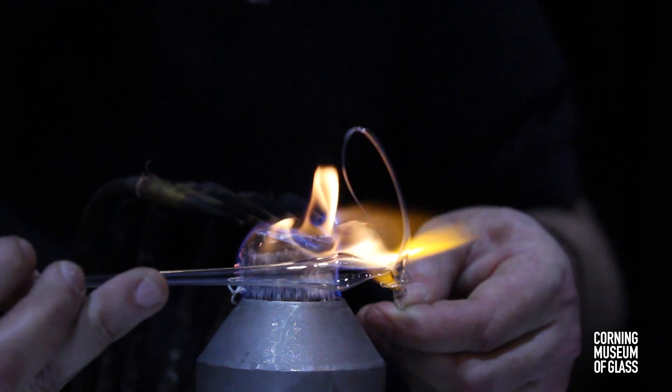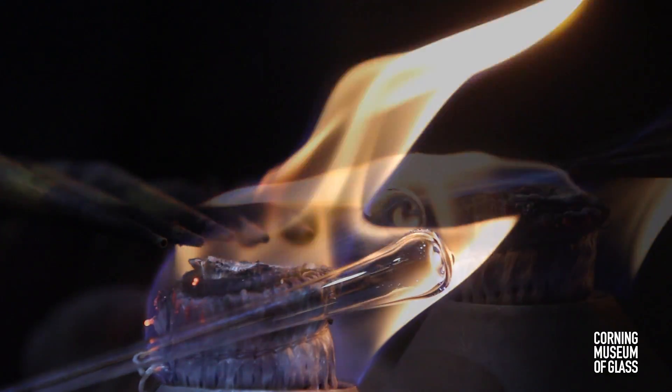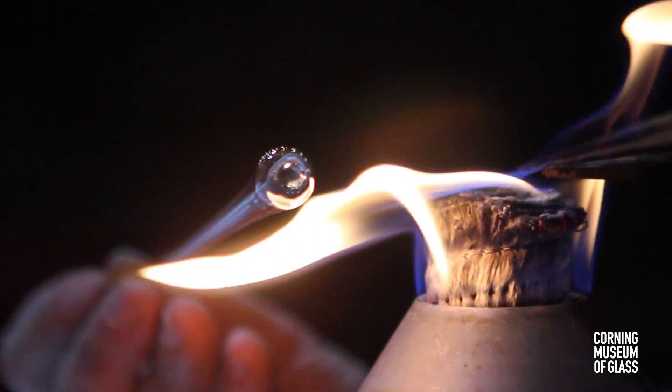Removing the excess glass leaves a tiny lens with a high magnification. Only two of these lenses survive.